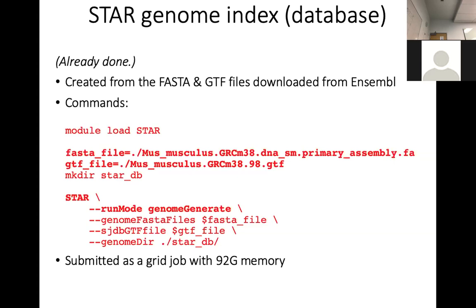Yeah, and I wasn't really necessarily expecting you to have done all this, but if you go to the workshop scratch folder. Oh, yeah. And now we have this GM directory. And so these are the assembly project object. And then this is the directory I was in from my friend.